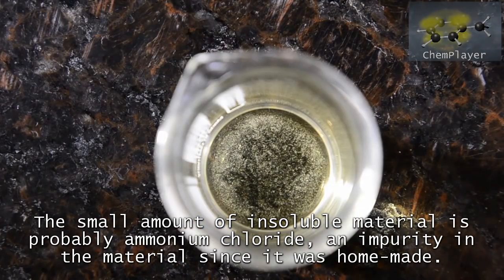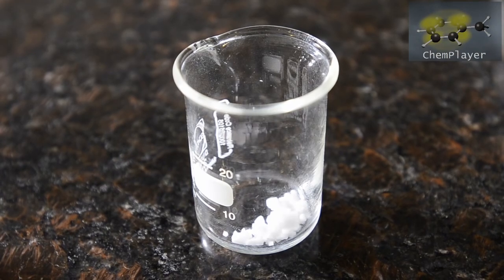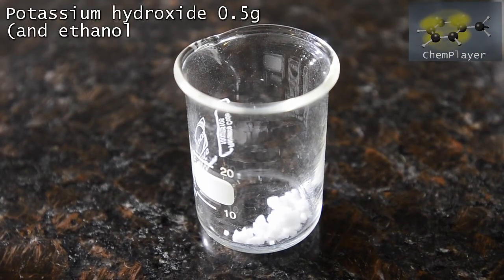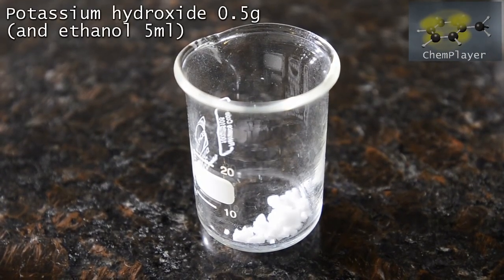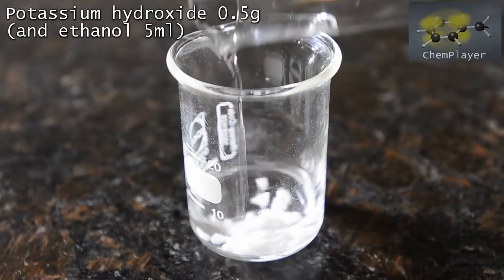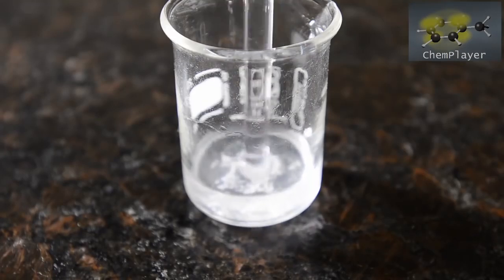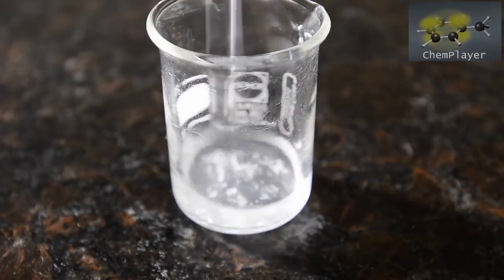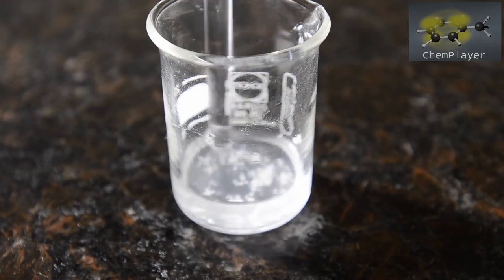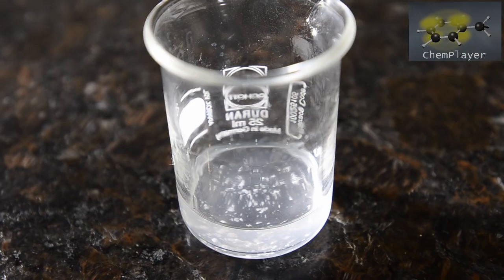as an impurity. Okay, now we need to convert our methylamine into the free base form which we need as our catalyst. So we weighed out 0.5 grams of solid potassium hydroxide, and we added 5 ml of absolute ethanol again. This took a few minutes of crushing and mixing in order to get it into solution. Most of it's in now, so this will do.